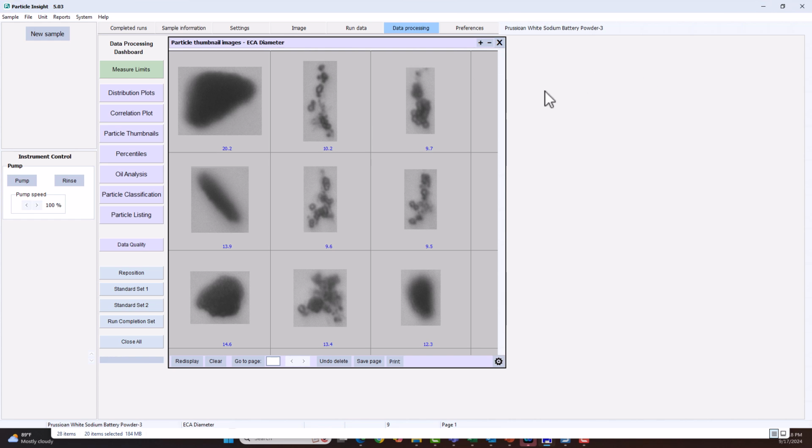So I hope this helps. This is a really good experiment that we did, comparing four different types of sodium ion battery materials, and definitely some differences in shape from what I've seen with lithium ion.